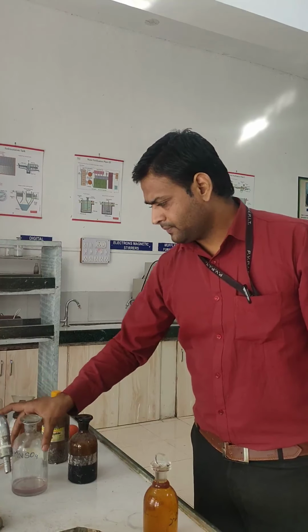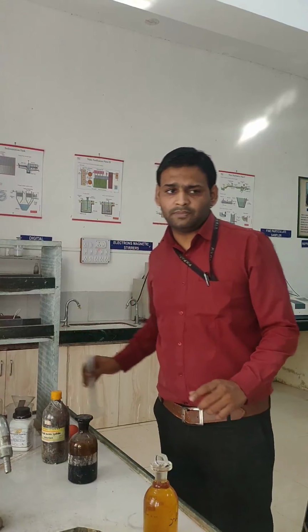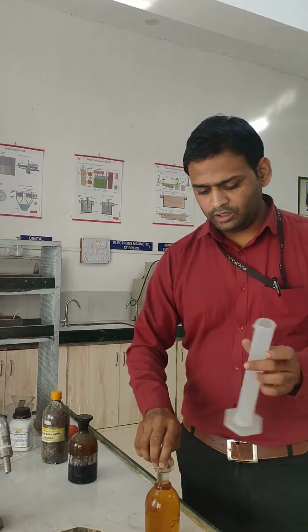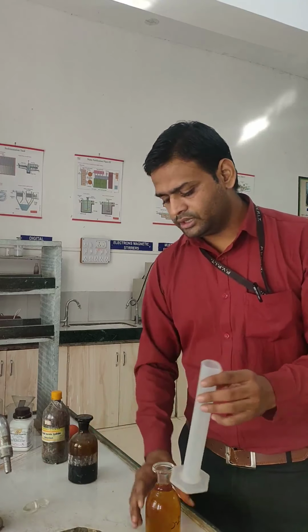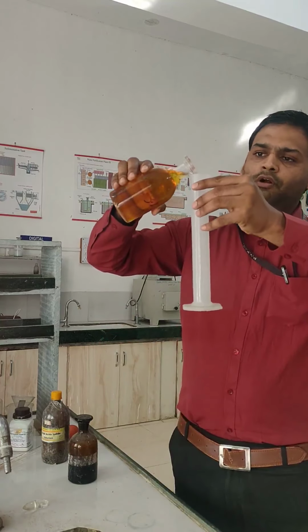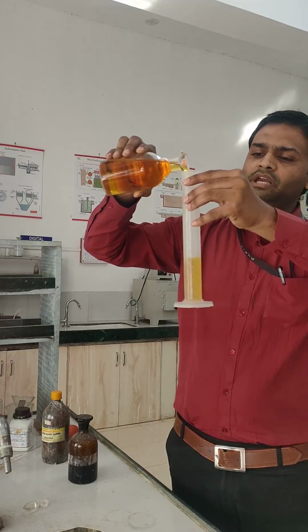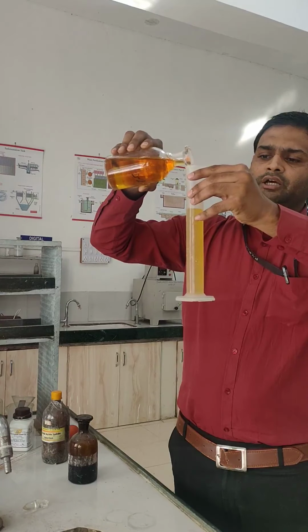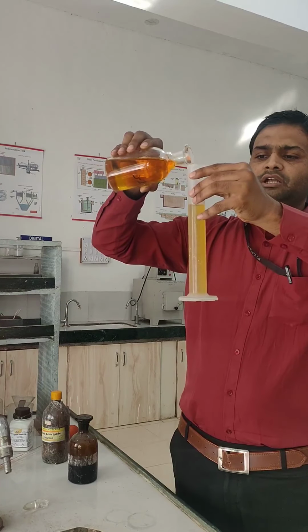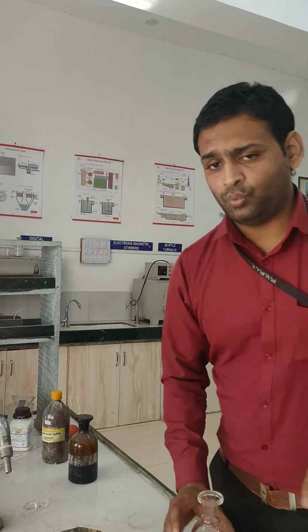Then we have to take 203 ml of water sample for titration in a conical flask, adding starch indicator. After adding the starch indicator to this particular sample, its color becomes blue.